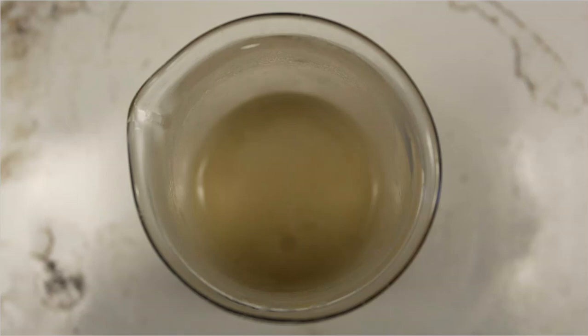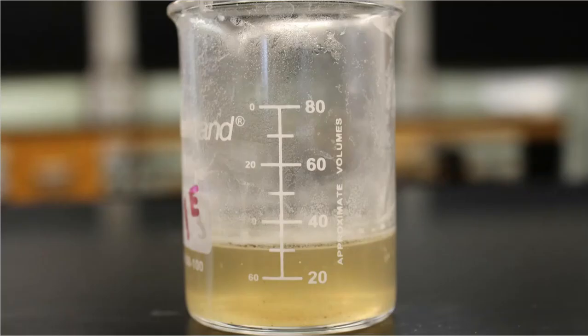And then as I continued to heat it, it did clear up, and I took it off the hot plate, and this is what it did. Now, I can clearly see there are maybe impurities in that solution, okay? So when my crystals reform, they are going to reform maybe a little bit better than they did before. And this is okay. Sometimes we saw brownish, tannish specks in that solid. We mentioned those before, and now I can really see those here.